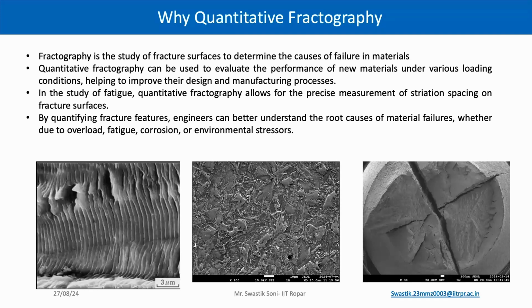Here are some of the microstructures which can explain this. This one is fatigue, due to striation spacing, and this one is having bright facets, so this may be brittle failure, and this one is through tensile.